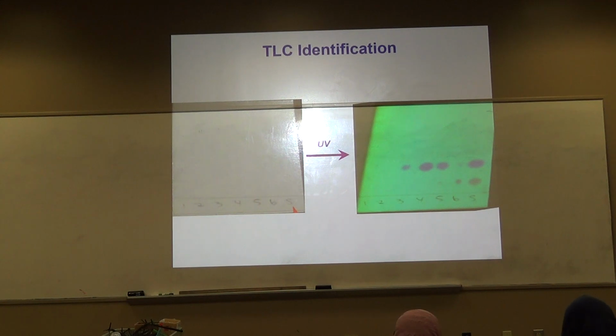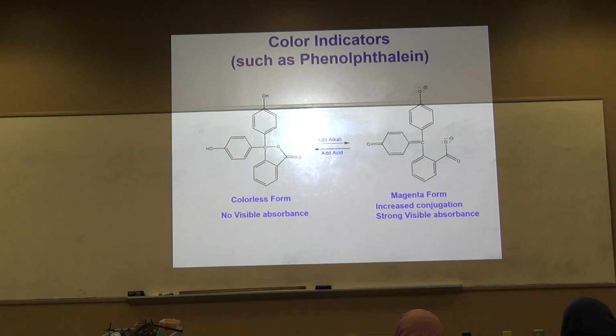And so have you guys used the longer light before and seen if anything shows up? Because different compounds can absorb differently. That's what we're talking about here, different absorptions. We're moving through this quickly, guys.